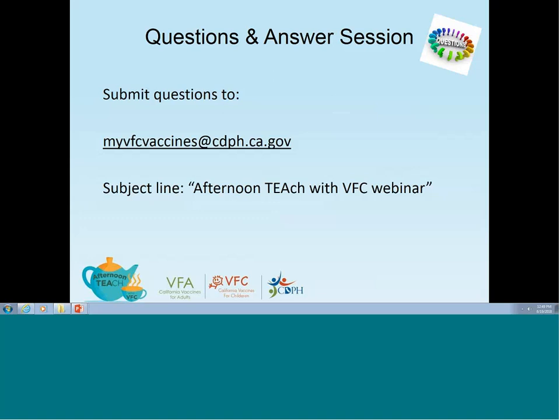Okay, I see. So the memory in the USB will get erased after we download it? Well, it depends on the device. I'm giving you a general explanation, but the main thing we want you to understand is that once you download that data and you restart that data logger, you don't want to be picking up the old temperatures that were already recorded. Okay.